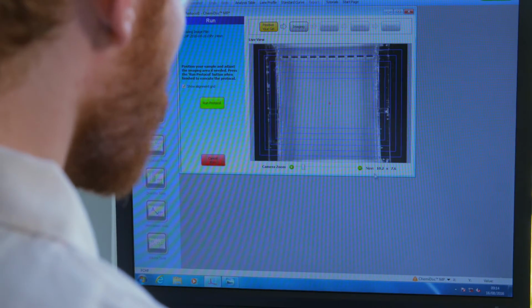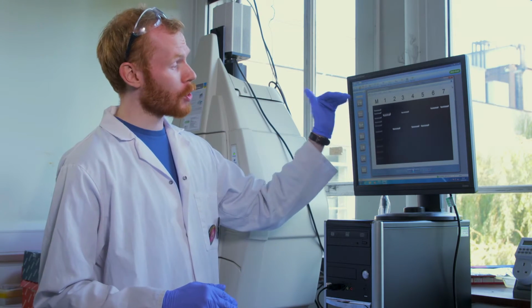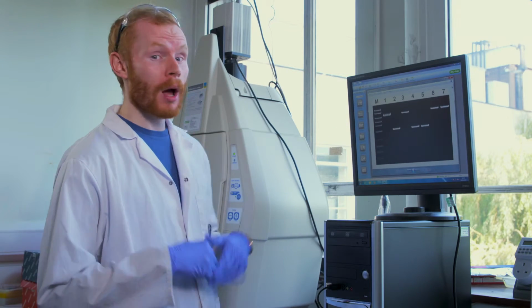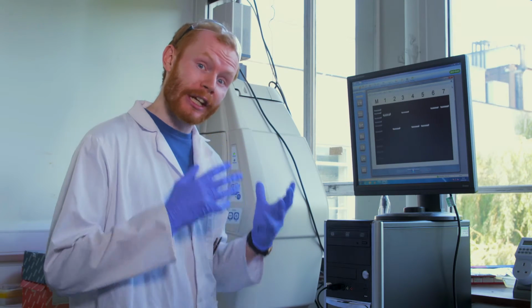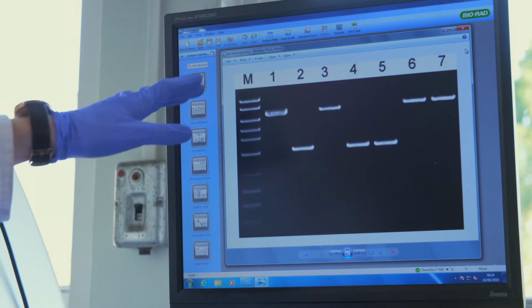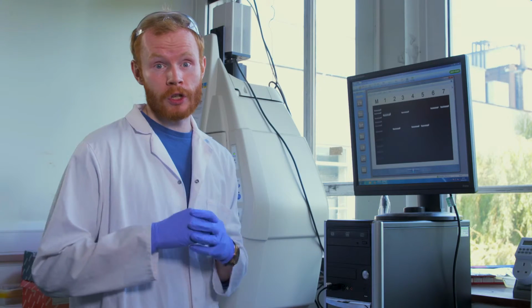So we end up with a number of bands that have run different distances from the top of our gel. The bands that have run further are from plants containing the deletion mutation, which generates a shorter gene, and the bands nearer the top are from plants without the mutation, so they have the normal length gene.